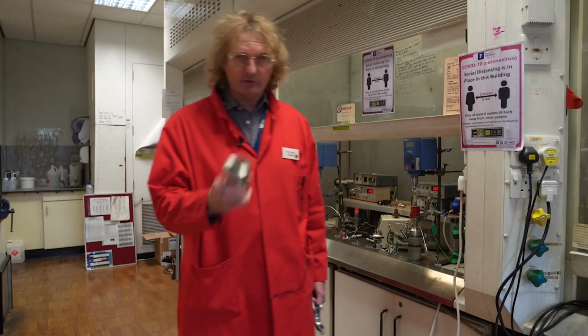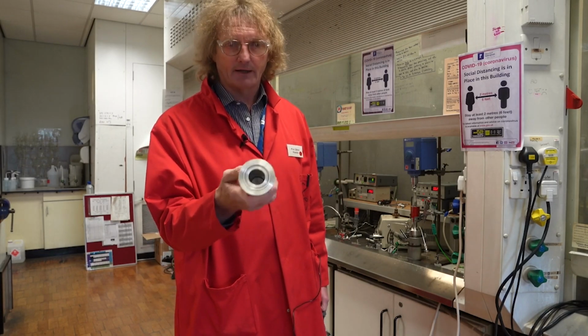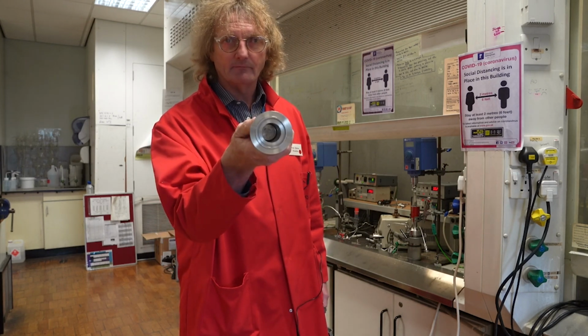So let's cut to the chase then. What do we do? Well, we do all our chemistry in one of these. So this is a 60 milliliter high pressure autoclave, and this is the business end of it. And you can see inside there that it's just a cylindrical vessel.